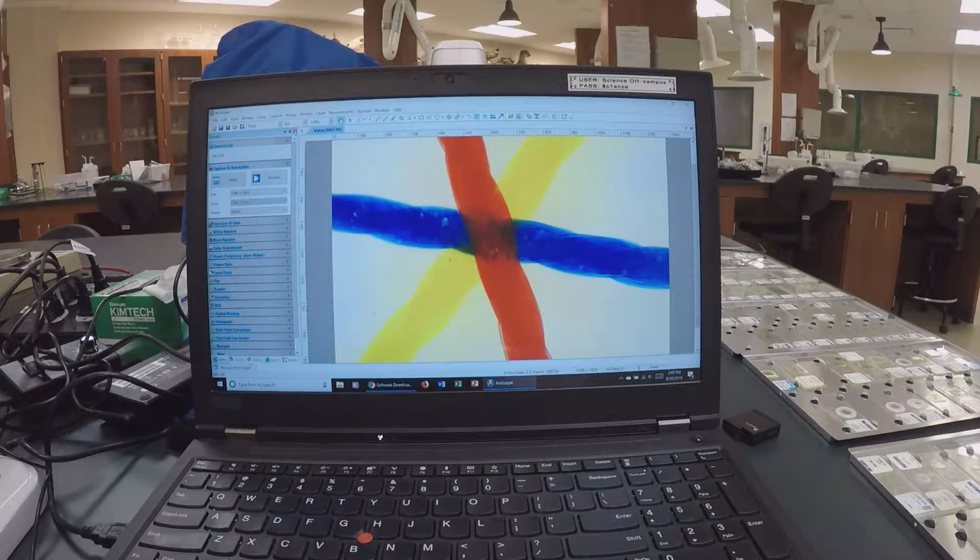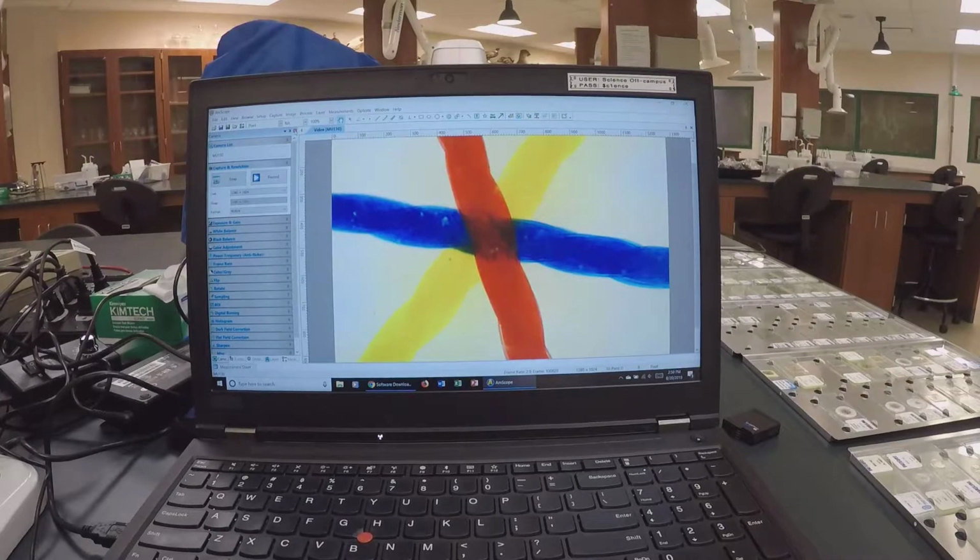Okay, and so from a dissecting point of view, the depth of field does not change with magnification. At least not our dissecting microscope. So going from 7 times your eyesight to 45 times your eyesight doesn't change what you see. It doesn't change what's in focus. On the other hand, with the compound light microscope, as you increase magnification, you decrease depth of field. We'll come back and start looking at some other slides.